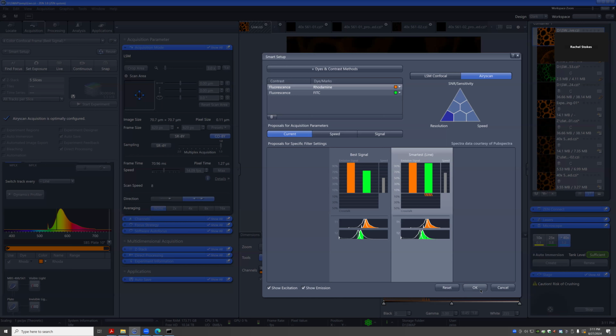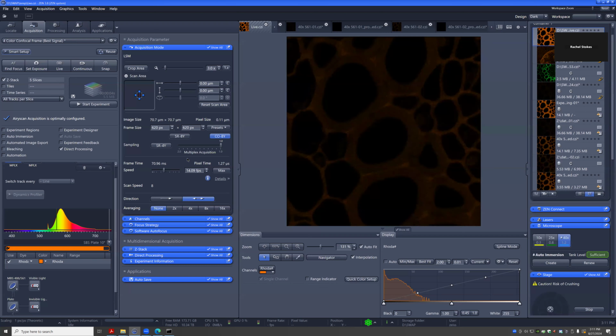Yeah, that's really the main difference. But that's a good question. Again, Germany will make things a certain way. I don't always agree with that, but that's why I'm pointing it out, because it makes it easier to think about, like, if you have fast versus the super resolution mode, and then confocal versus super resolution sampling. It's always good to keep in mind where my sampling is sitting.